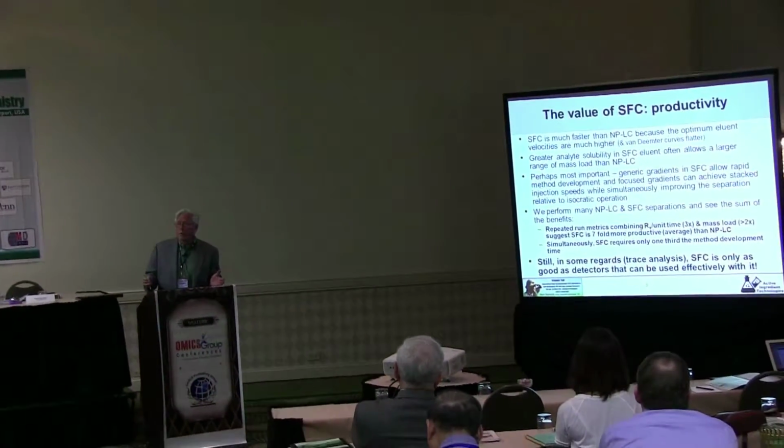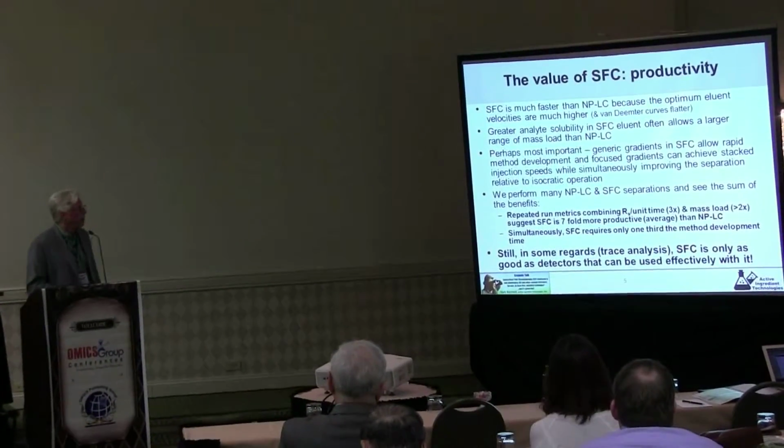But the real thing here is, can we detect what we want to detect, and can we get a lot of work done? Because we only get the check if we get a lot of work done. We're not going to keep that check coming if we're only getting a little work done. SFC is much, much faster than normal phase LC. You often have much greater analyte solubility, and one of the very most important things that adds to the productivity of SFC is you can do generic gradients just like you would in reverse phase HPLC. So you can have a broad gradient and often get the answer the first shot. That helps quite a lot with productivity.